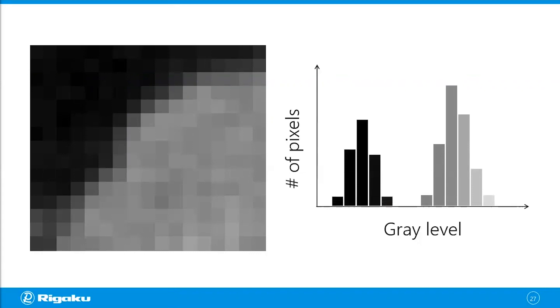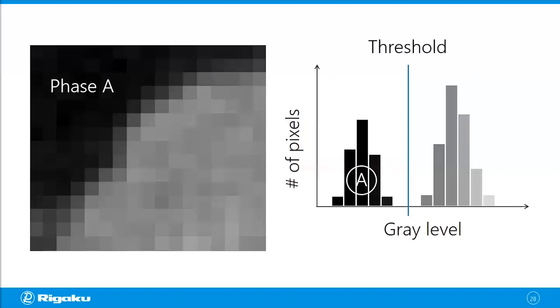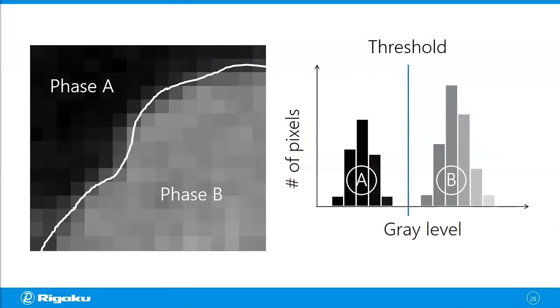When you look at this histogram you realize there are two peaks: one for the dark pixels and one for the lighter pixels. This means you can set a threshold between those two peaks and say all pixels on the left side belong to phase A — the dark pixels — and map them back to the original image. You can do the same thing for the lighter gray pixels, phase B, and map them back. This is how you can segment an image into two different phases.